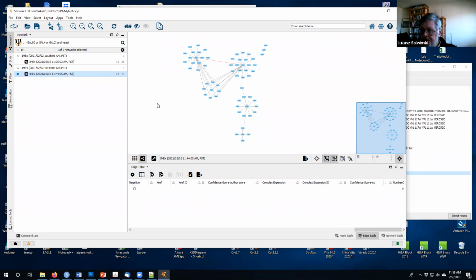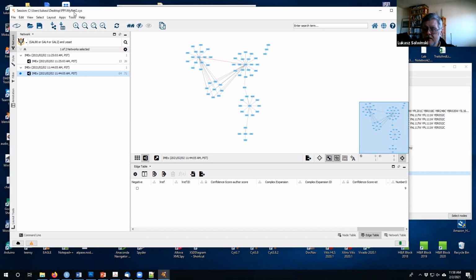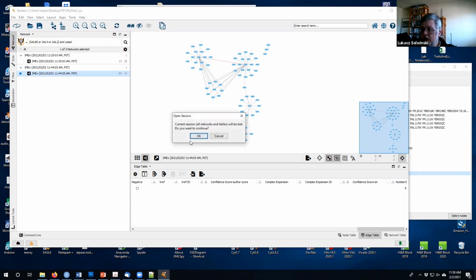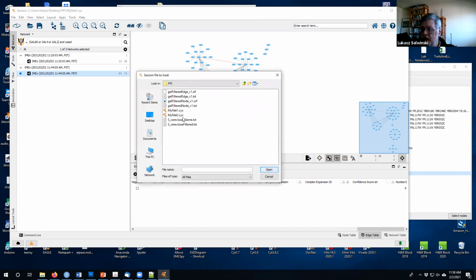If you want to practice, let's open the previous thing. Let's open current session. Okay, I'm gonna get this guy.